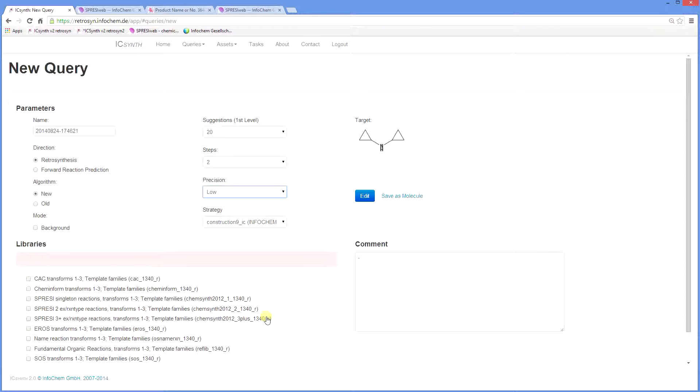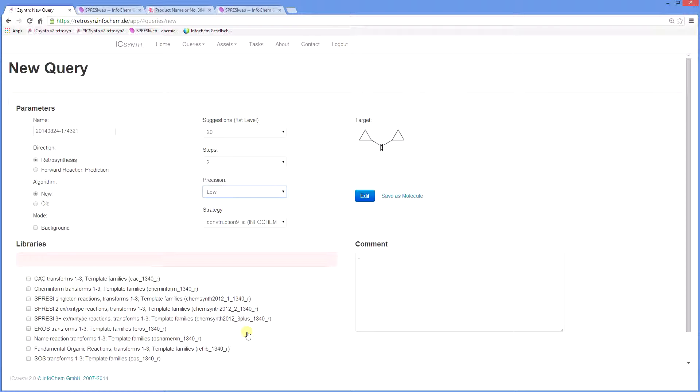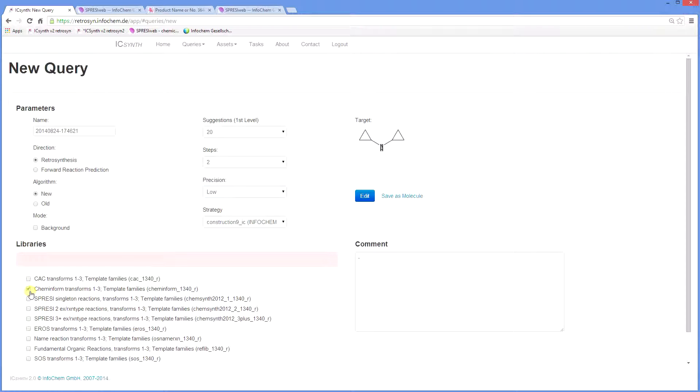Finally, you need to choose which of the reaction libraries you wish to use. These are at the heart of ICSynth, which is an algorithmic chemical knowledge base of transform libraries. They are automatically generated from some well-known published reaction databases. In this case, we will select ChemInform, Spresi with three or more reaction examples, and name reaction transformations.